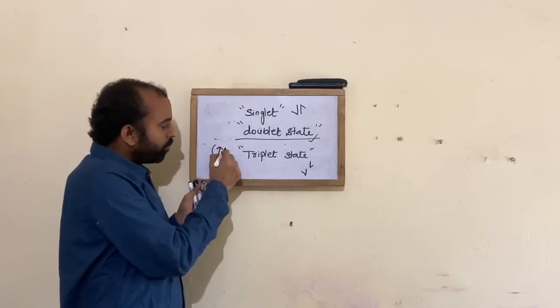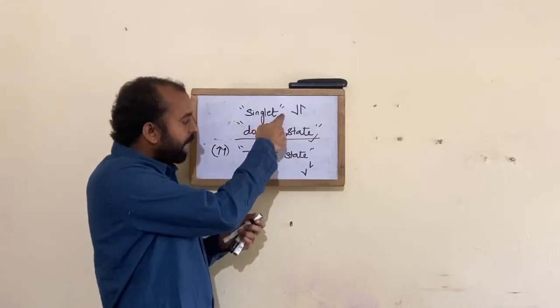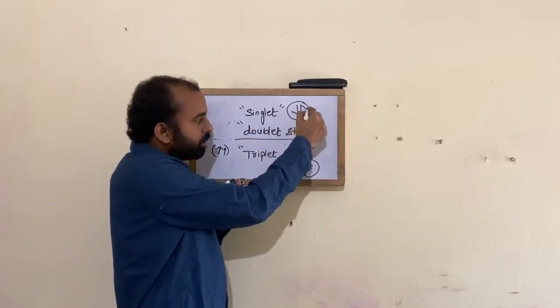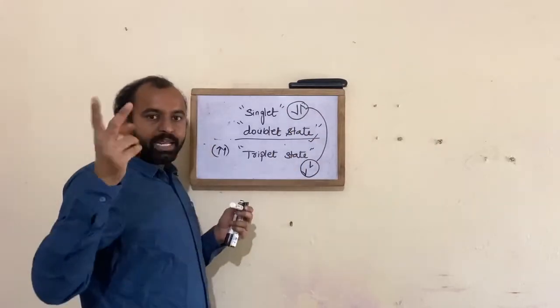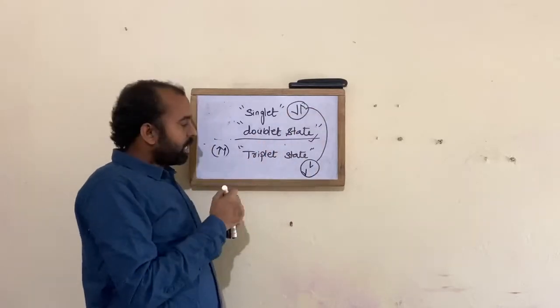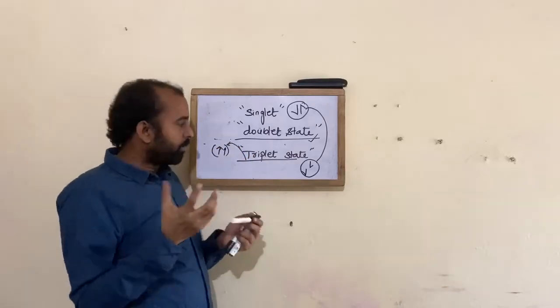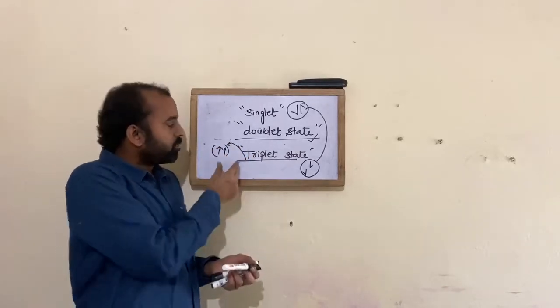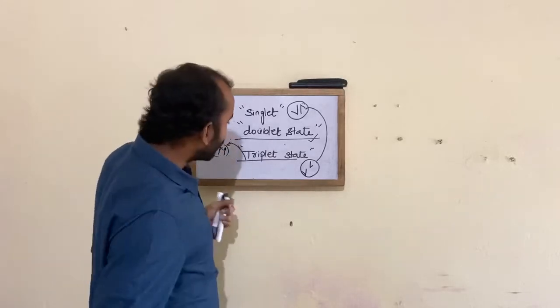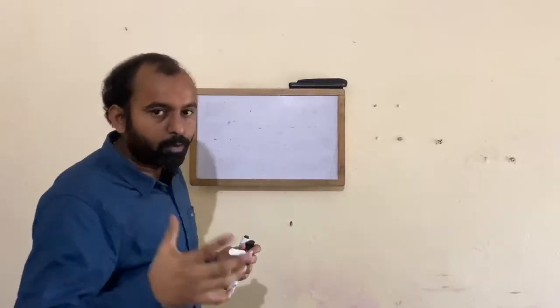So this is one more thing you need to know. The spinning states, that means the singlet excited state and singlet ground state, both are in pairing with each other. That means the total amount of excited and ground state are the same, whereas in the triplet state you have unpaired states with the same spin. So this is what you need to know before studying any of the fundamentals of fluorescence spectroscopy. So in fluorescence you have a concept called the Jablonski diagram.